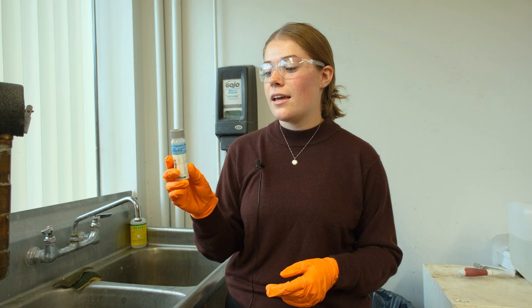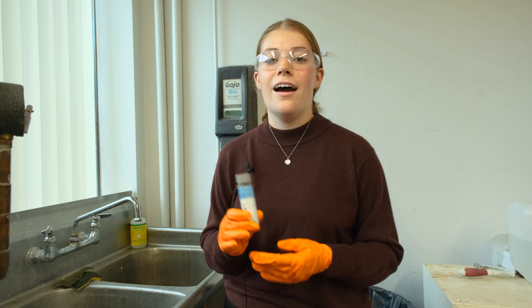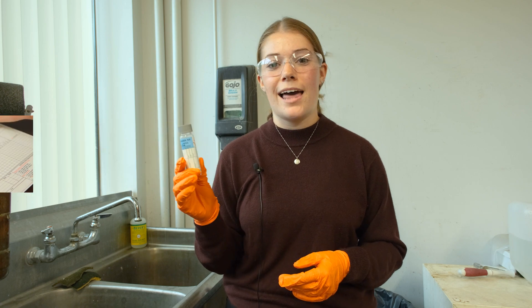The lab may have you take two or three VOA vials depending on what they require. Go see our other video on how to fill out a chain of custody for submitting these samples to the lab.